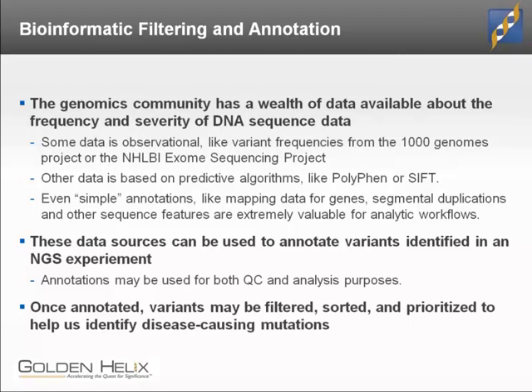In terms of a QC, you see people dropping variants that are in segmental duplications, known repeat regions, or near gaps in the human genome assembly. Those are areas that are known to be difficult to align short reads to. And so they decide to just ignore any variant calls that they have there. So that's more of a QC approach. And as we go along today, I'll show you some examples of how you can do both of those things in our software and using some other tools as well.